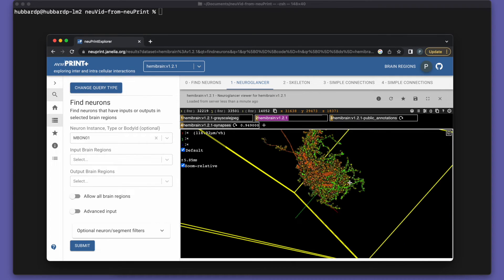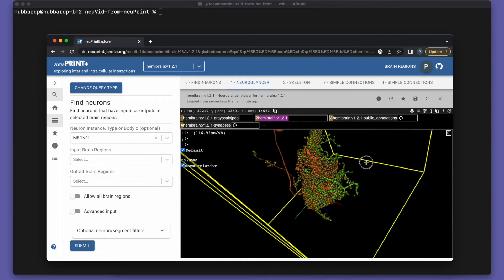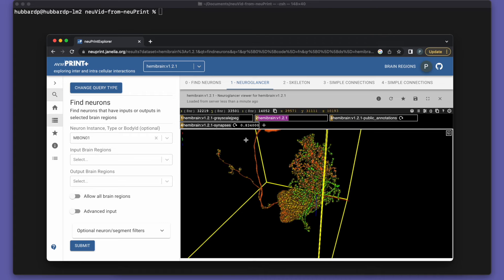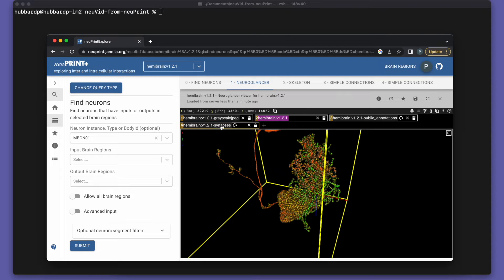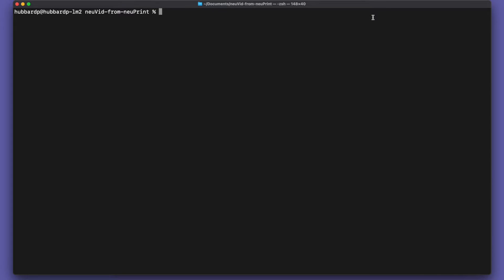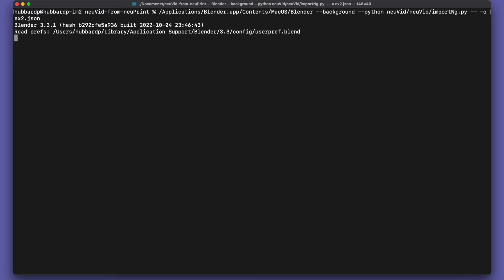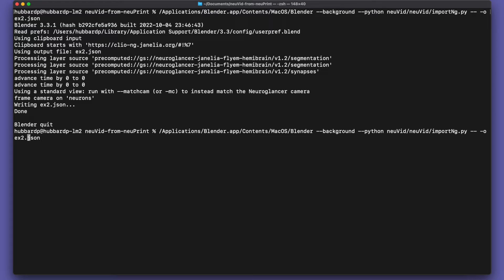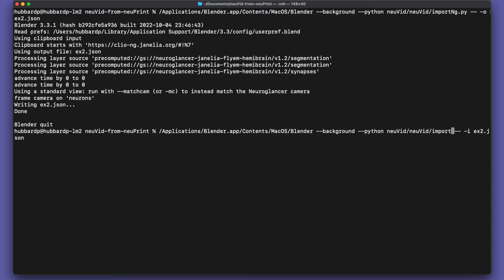So we'll go to the NeuroGlancer view. And for this fancier video, we're going to keep the synapses in, so we don't need to hide them there. We just grab the NeuroGlancer information from the clipboard, put the NeuroGlancer information into our JSON file.